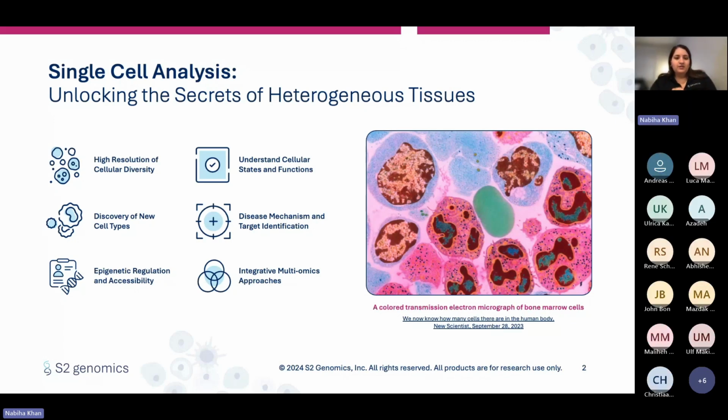So we all know that biology is immensely complex and that each organ is made up of many different cell types. One recent advancement in genomics is the adoption of single-cell genomics assays, which gives scientists the ability to study transcriptome and epigenome at the single-cell level in millions of cells simultaneously, allowing us to measure cell types and diversity at an unprecedented scale and resolution.